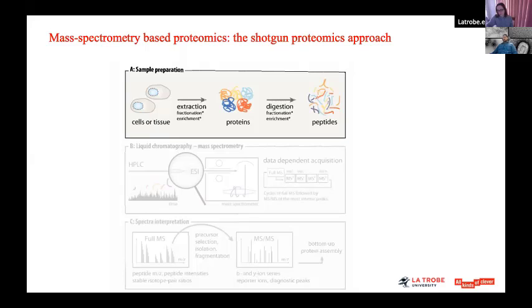And the lysine and arginine residues appear in proteins such that usually the peptides that we obtain are between 6 and 15 to 25 amino acids, which is exactly what the instrumentation needs.